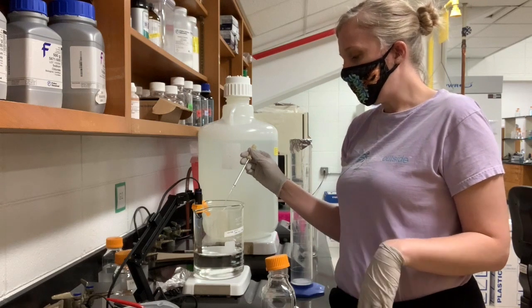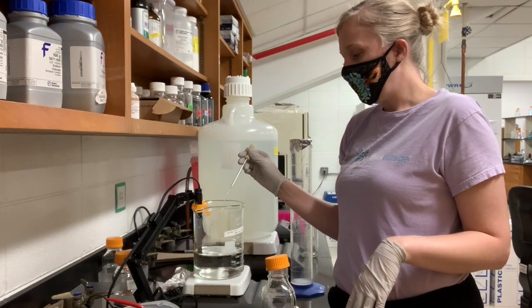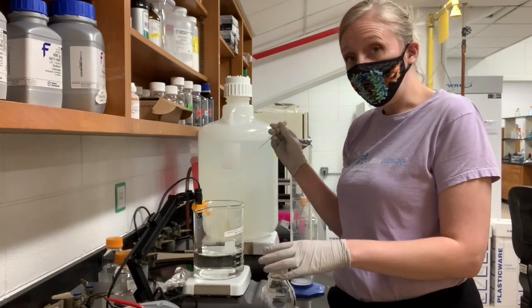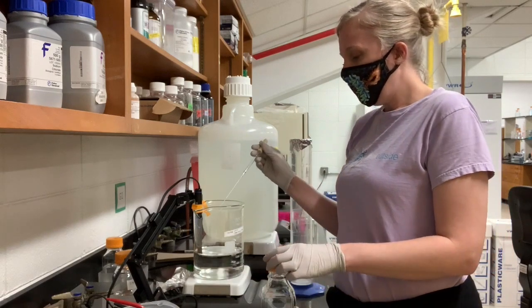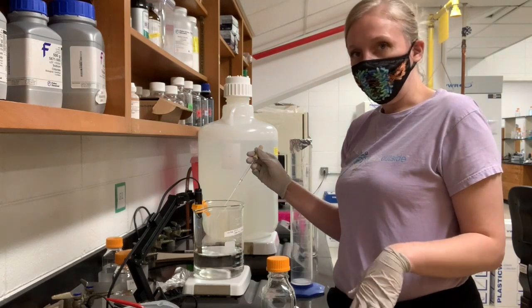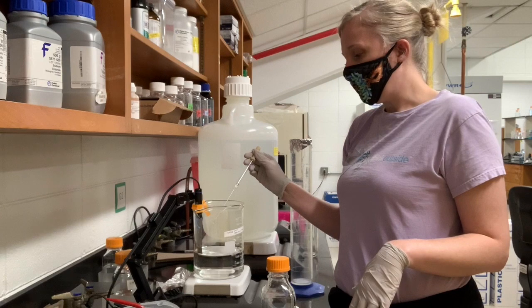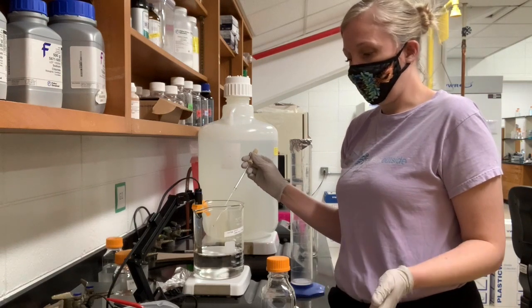One thing you should remember, you may recall in basic or general chemistry, that pHing will not happen linearly when you have a buffer. So this is a phosphate buffer. If you think to yourself, well, I added 10 droplets and the pH changed a certain amount, that won't always be true. So at first it was changing pretty slowly and now it's changing more quickly. It's 7.22.